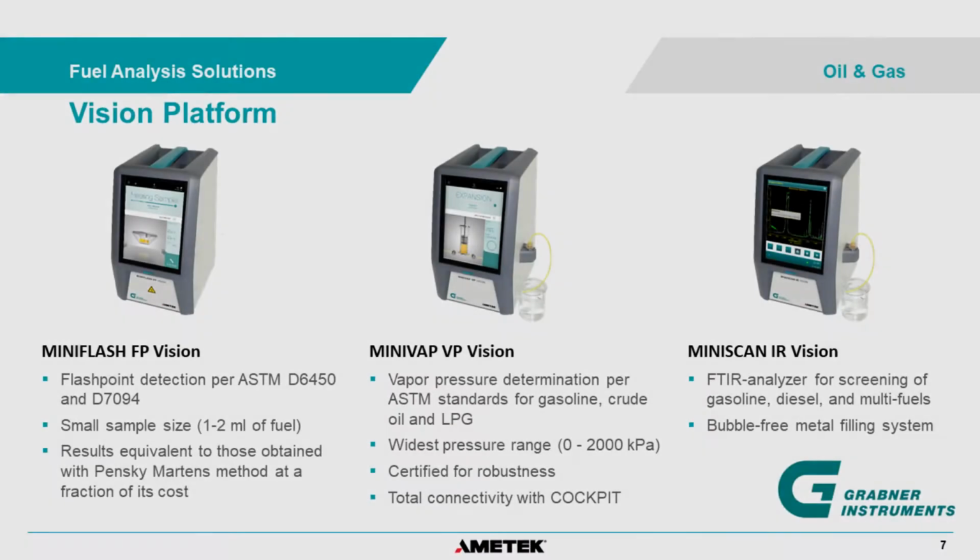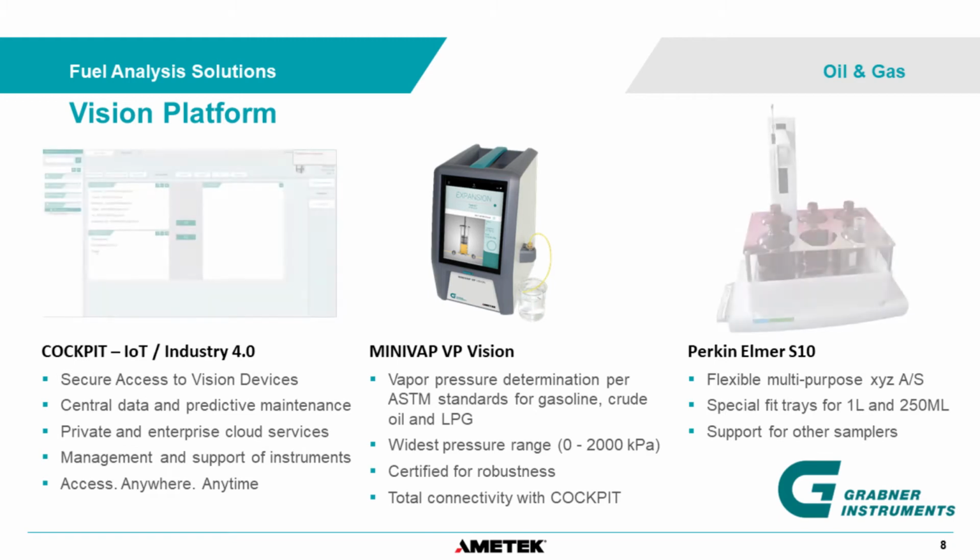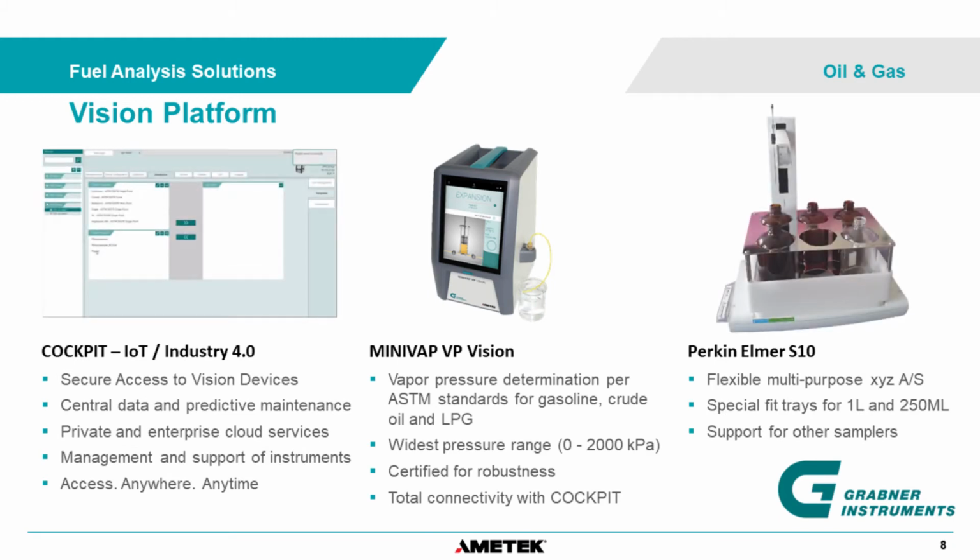The Vision platform consists of the FP Vision flashpoint tester, the VP Vision to test vapor pressure, and the IR Vision to analyze different fuel properties. Together with our cockpit IoT software, the VP Vision can be configured to work with any XYZ Autosampler.